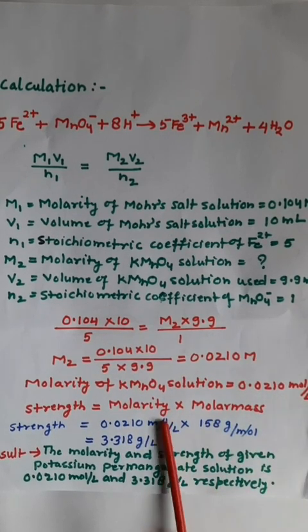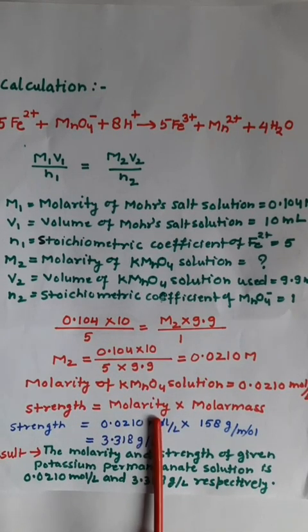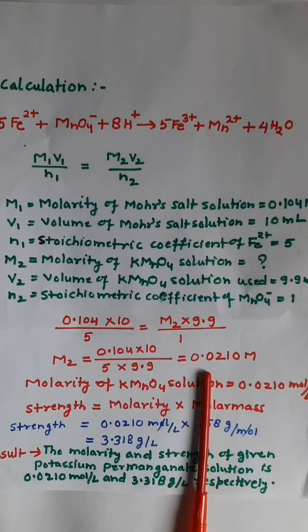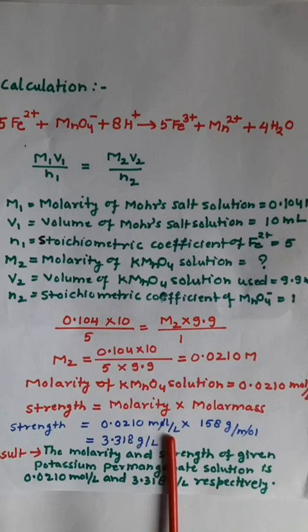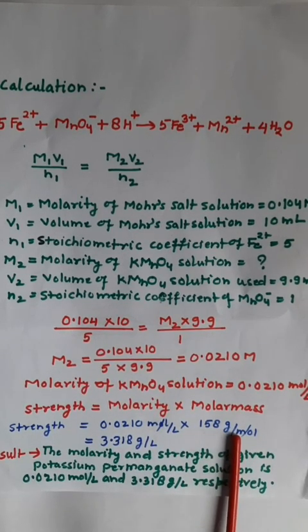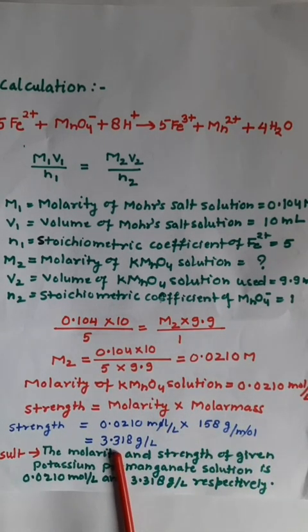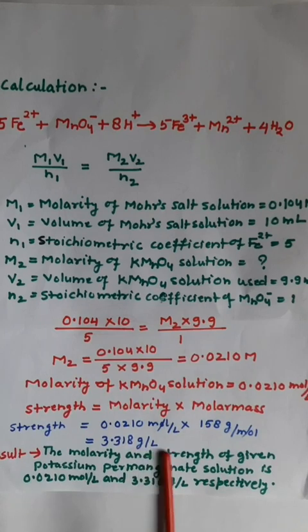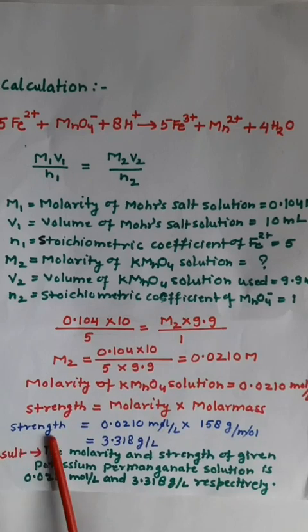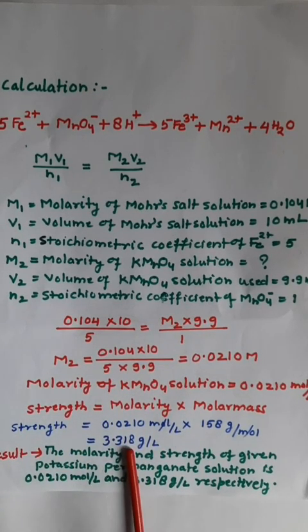Now for calculating the strength of the KMnO4 solution, you have to multiply the molarity of the KMnO4 solution by its molar mass. Here the molarity of KMnO4 solution was found to be 0.0210 moles per liter, multiplied by the molar mass of KMnO4, which is 158 grams per mole. On multiplying these two, we get 3.318 grams per liter, and hence the strength of the given potassium permanganate solution is 3.318 grams per liter.